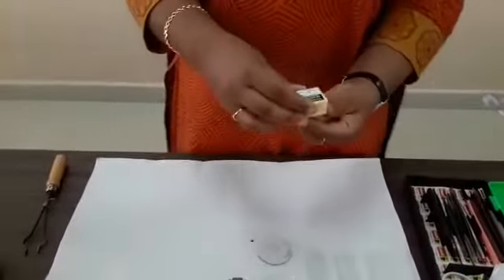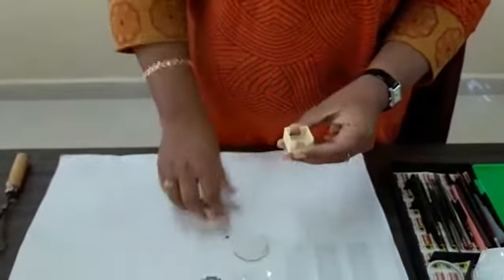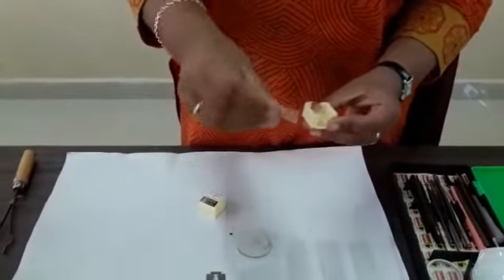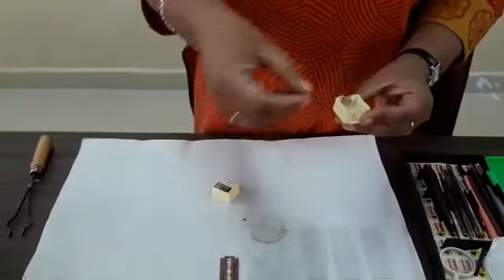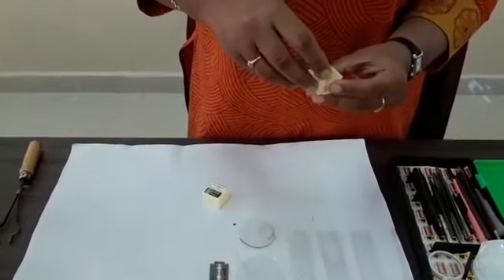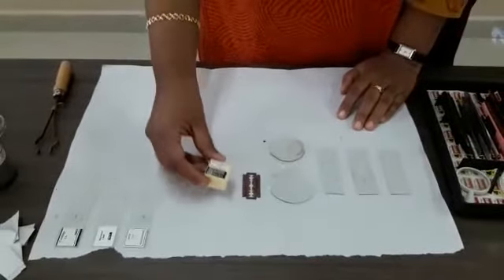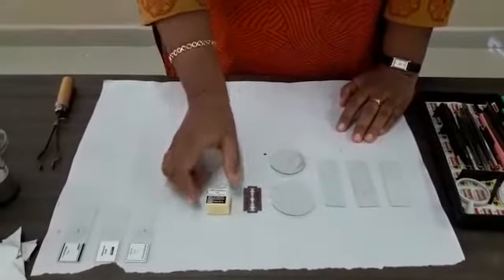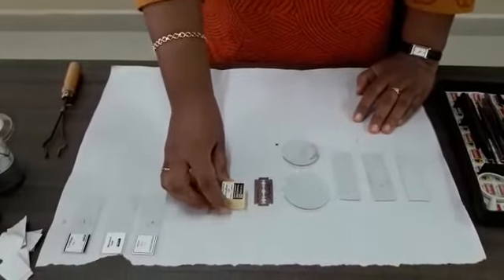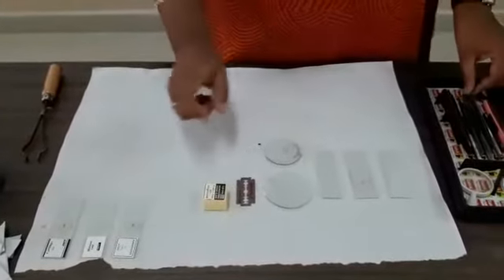This is the cover slip. In a dissection box there will be a box consisting of cover slips. You can see they are very delicate glass pieces called cover slips. You have to purchase one full box because when you purchase a dissection box there will be only one cover slip, but you need a whole box — so purchase it separately. Around 20 cover slips will be there, and since they are very delicate and break during dissection, you need to have spares.